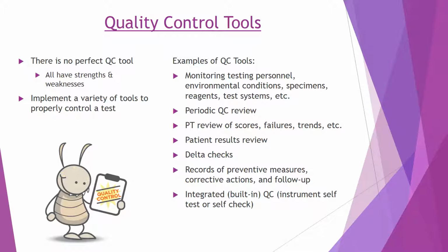Records of preventive measures, corrective actions, and follow-up. You can go through and see how often we had to do corrective actions. Did we follow up on that? Did we follow through on that and fix the problem? And there are some other examples listed there as well.